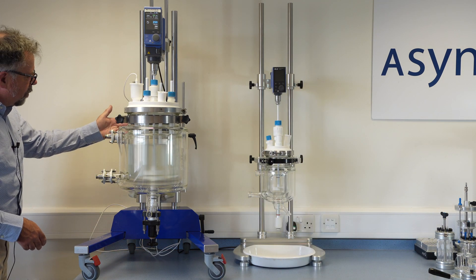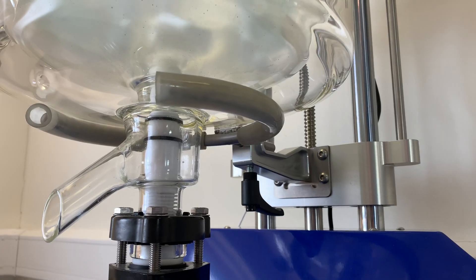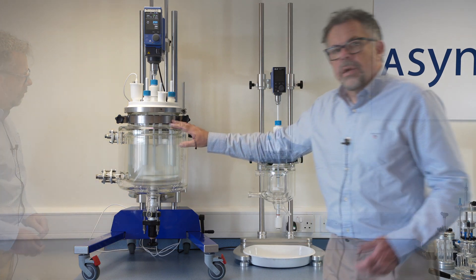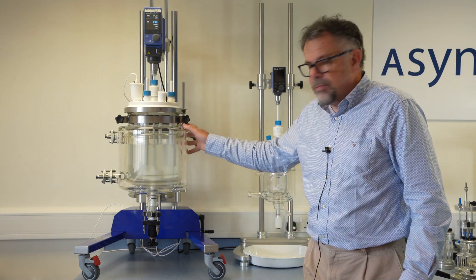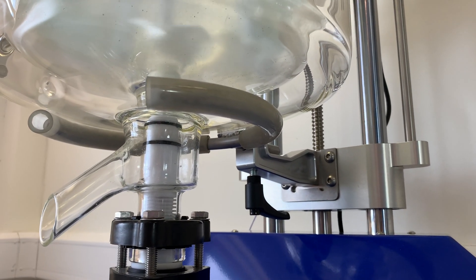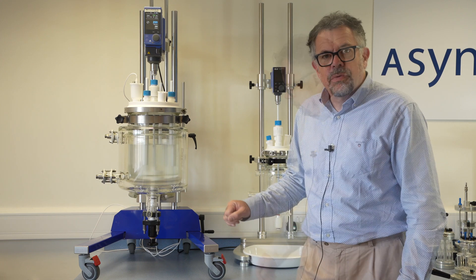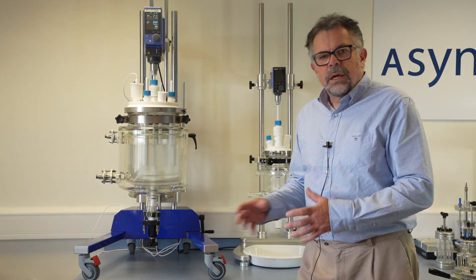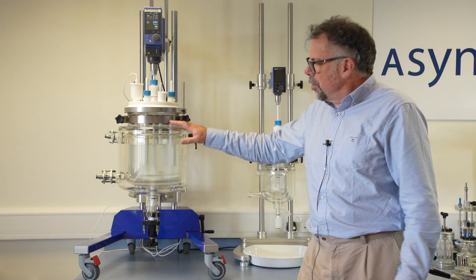At the rear of the unit we have two chariots, and the distance between these can be changed very simply depending on the height of the reactor vessel, making it very easy to swap your reaction vessel. Because of the weight of a glass reactor vessel — especially above the five liter size when full or with a vacuum jacket — we don't just support the vessel from the top; we also support the bulk of its weight at the bottom. The height adjustment mechanism uses engineering bearings so there's no movement or slack, no wobble, and no locking is needed to hold it in position.